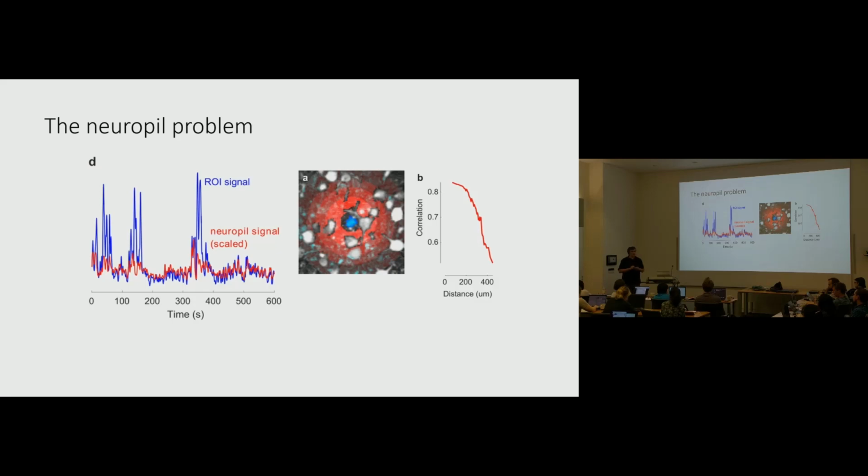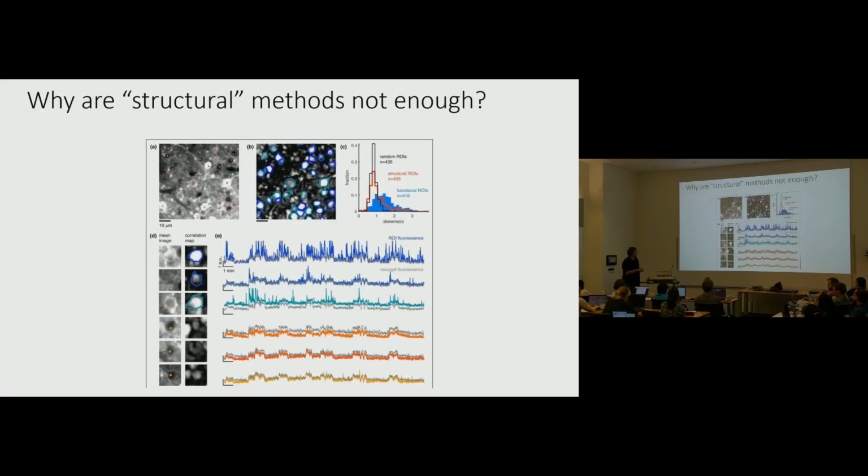Because now you have to rely more on these cells' transients. So you have to rely on these outliers to tell roughly how much fluorescence is in the cell versus coming from the outside. You can do these scatter plots. I don't think I have them here, but you could scatter plot the gray trace versus the blue trace. And what you'll typically see is a cloud of points that represents this baseline, and a few points at the outliers sticking out of that cloud. And so there have been various methods developed based roughly on looking at those plots. Like you can imagine doing a robust regression to discard outliers and fit to the cloud.